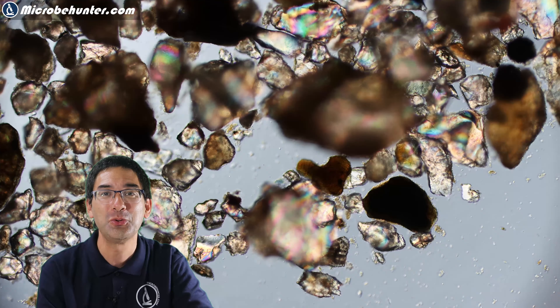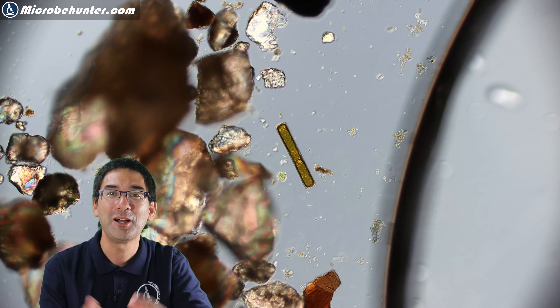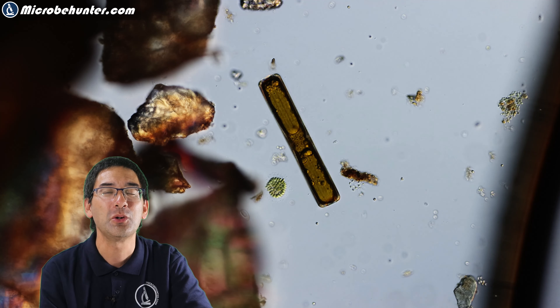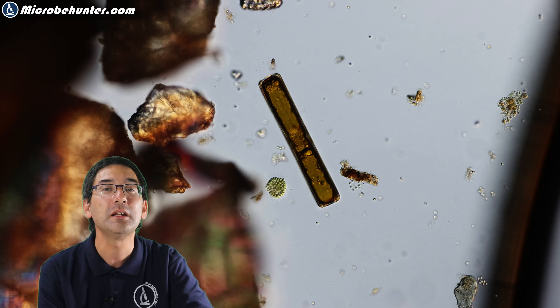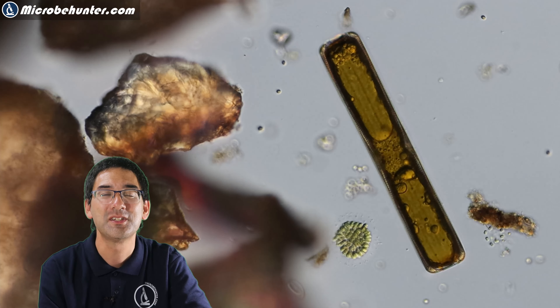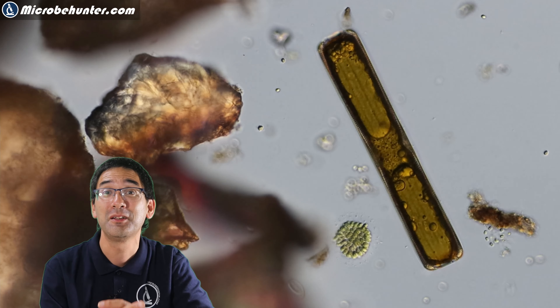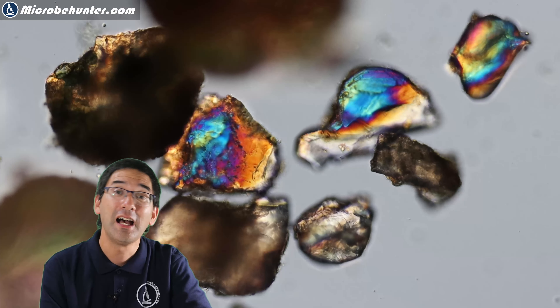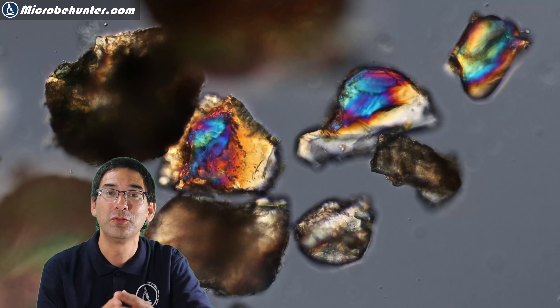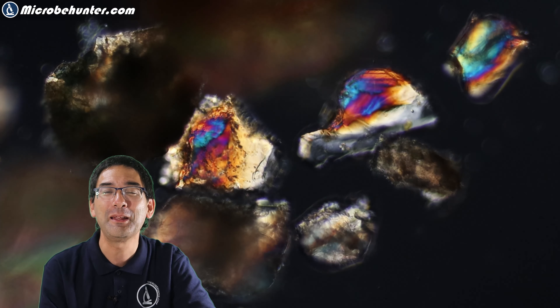Those diatoms are quite common — and the sand grains also look quite nice. Going up with the magnification reveals slightly more detail, and to the left of this diatom there also seems to be some colonial algae. If you look carefully you can see quite a bit of life in the sediment. The diatoms look quite nice with their silica shell, packed with chlorophyll and chloroplasts, because they too produce quite a bit of oxygen. I played around a little bit with the polarization settings of the microscope, which gave some of the sand grains a beautiful rainbow color.